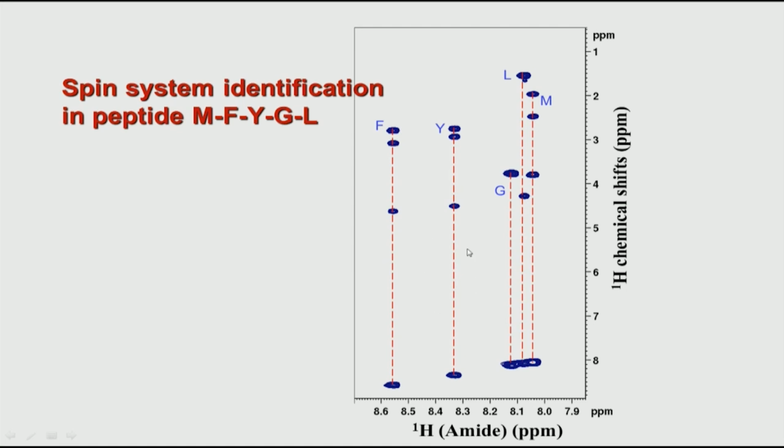If you go in this line, this also looks pretty much like a phenylalanine, but it could be the next amino acid, which is tyrosine. But remember, we do not know which is which right now. Although I have labeled it phenylalanine here and I have written tyrosine here, it does not mean that we have assigned it correctly. In reality, when you actually start with an unknown spectrum with a known peptide sequence, you do not know which is which. So, we will see how we can establish that identity, that this line is indeed tyrosine and this line is indeed phenylalanine.